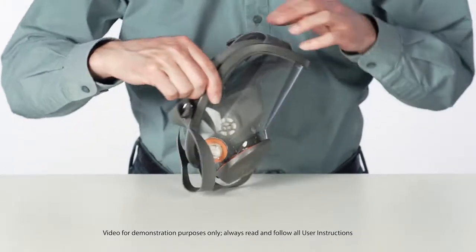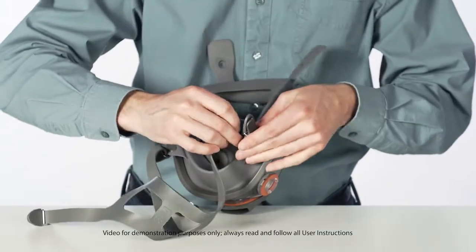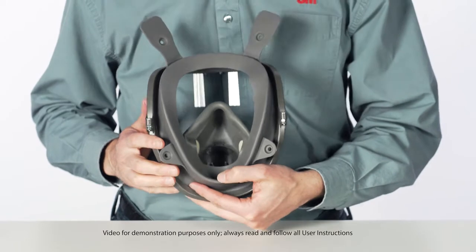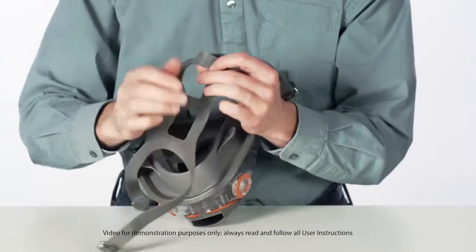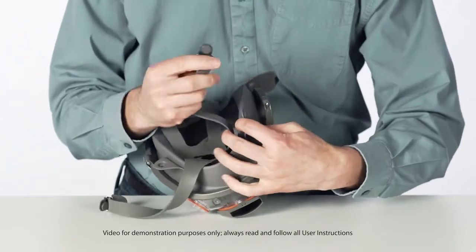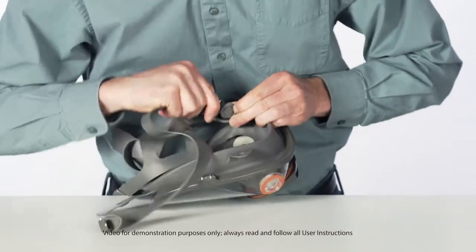Remove the existing harness assembly by pulling the buckle attachment buttons out of the holes in the face seal tabs. Position the new head harness with short straps toward the top and 3M and 6897 markings facing away from the respirator. Attach the new harness assembly by pressing the attachment buttons into the face seal tab holes and then twisting to ensure the buttons are fully seated.